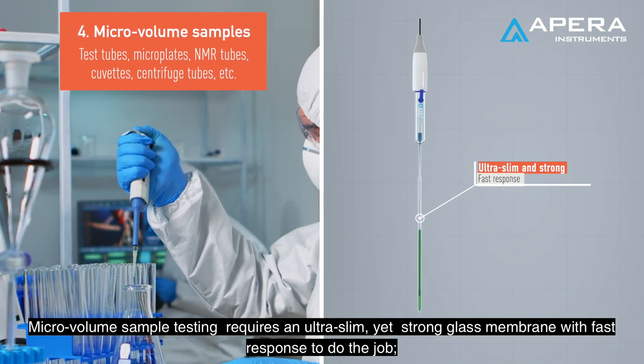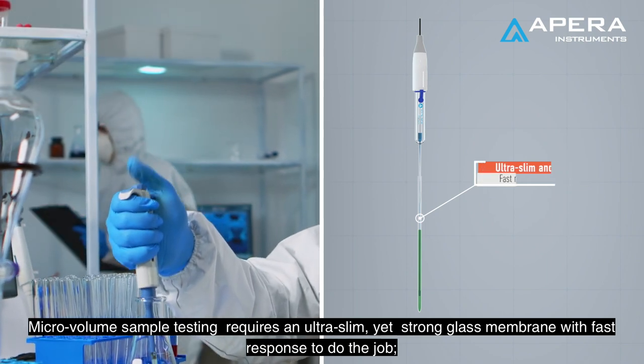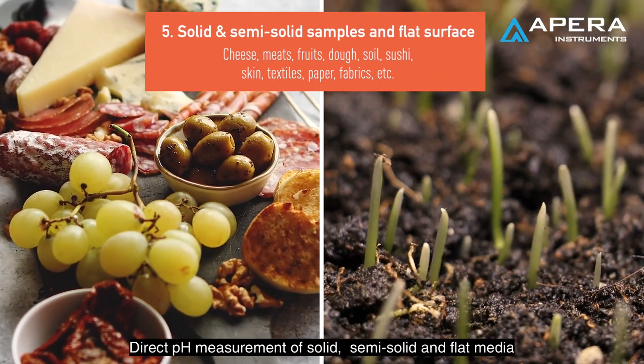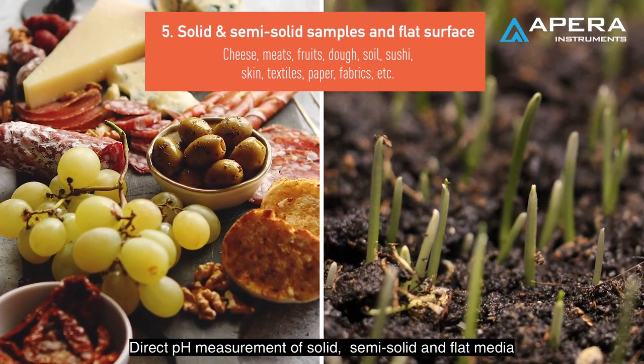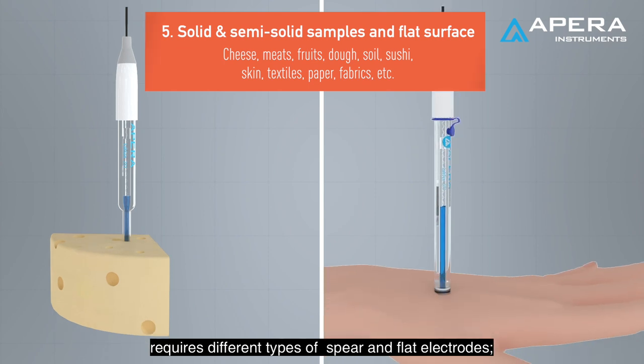Micro volume sample testing requires an ultra-slim yet strong glass membrane with fast response to do the job. Direct pH measurement of solid, semi-solid, and flat media requires different types of spear and flat electrodes.